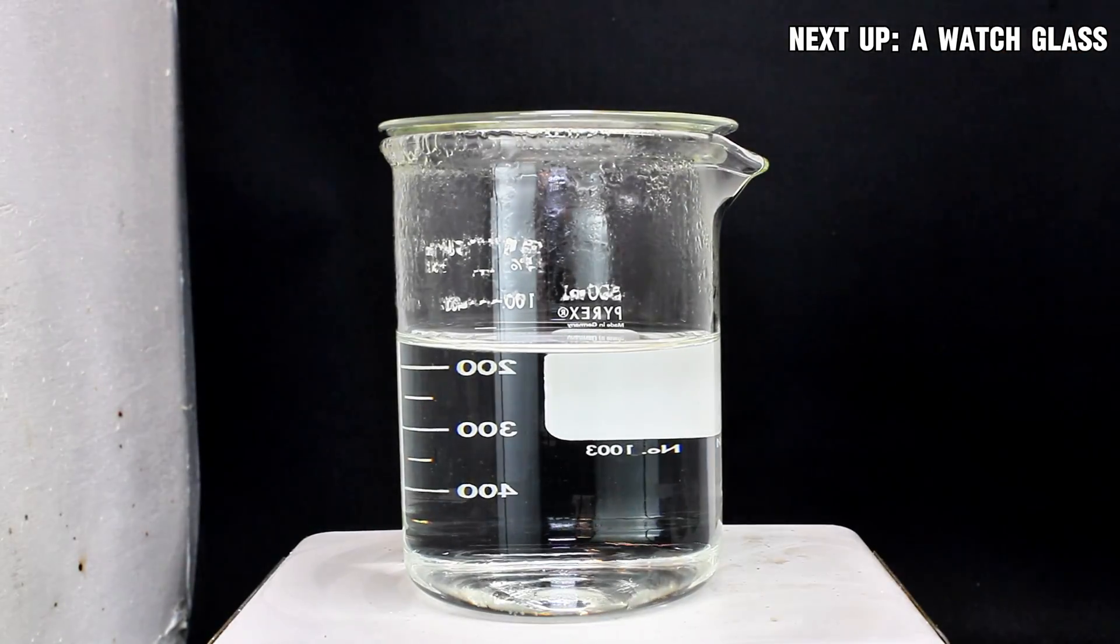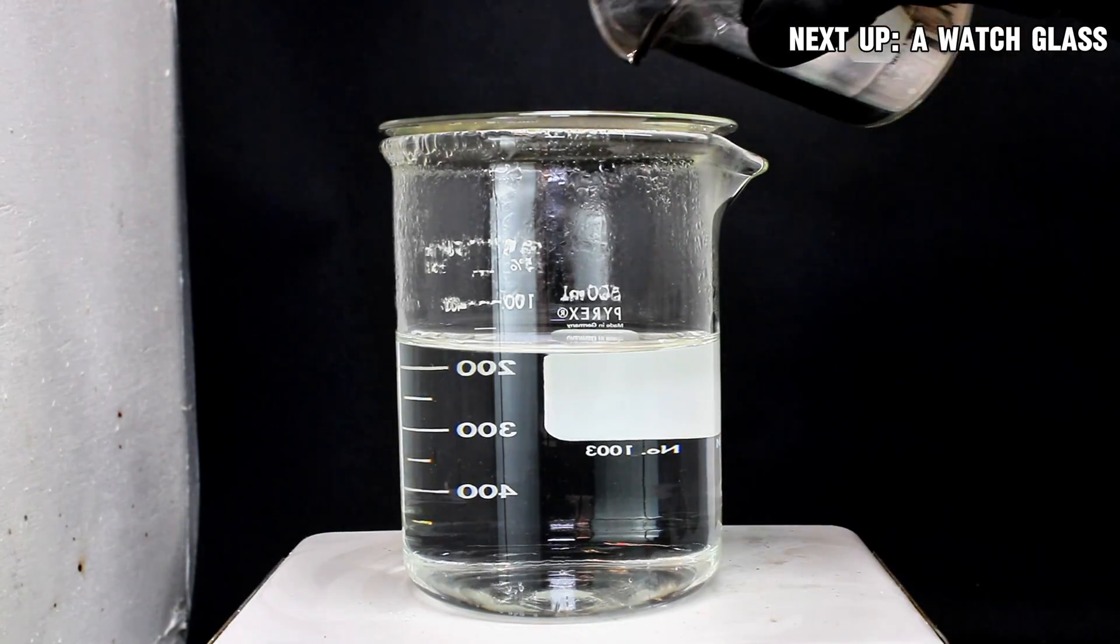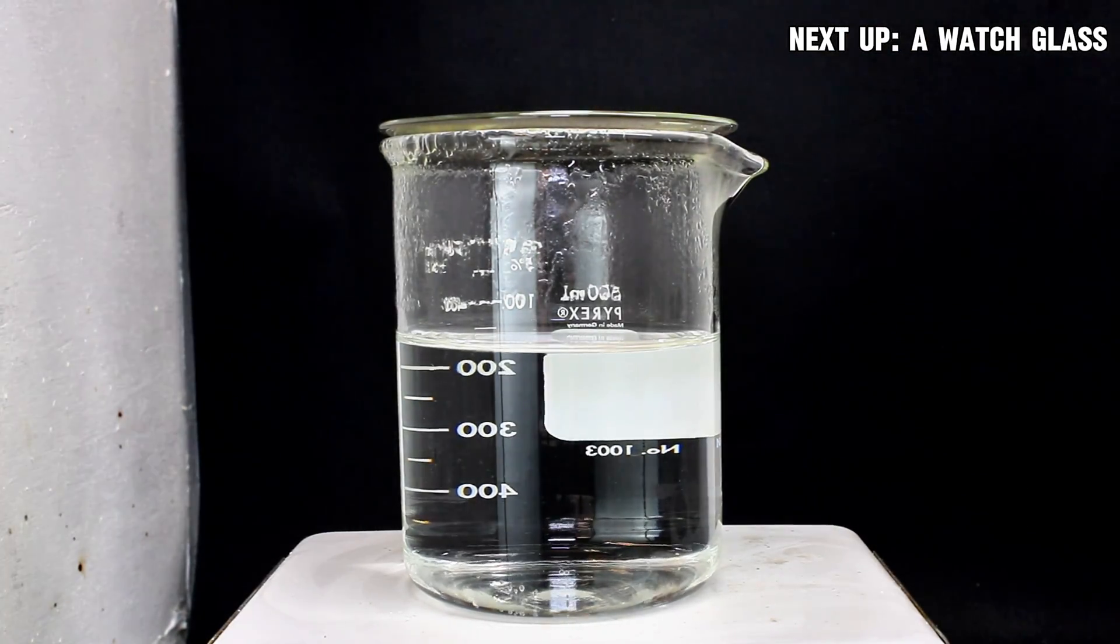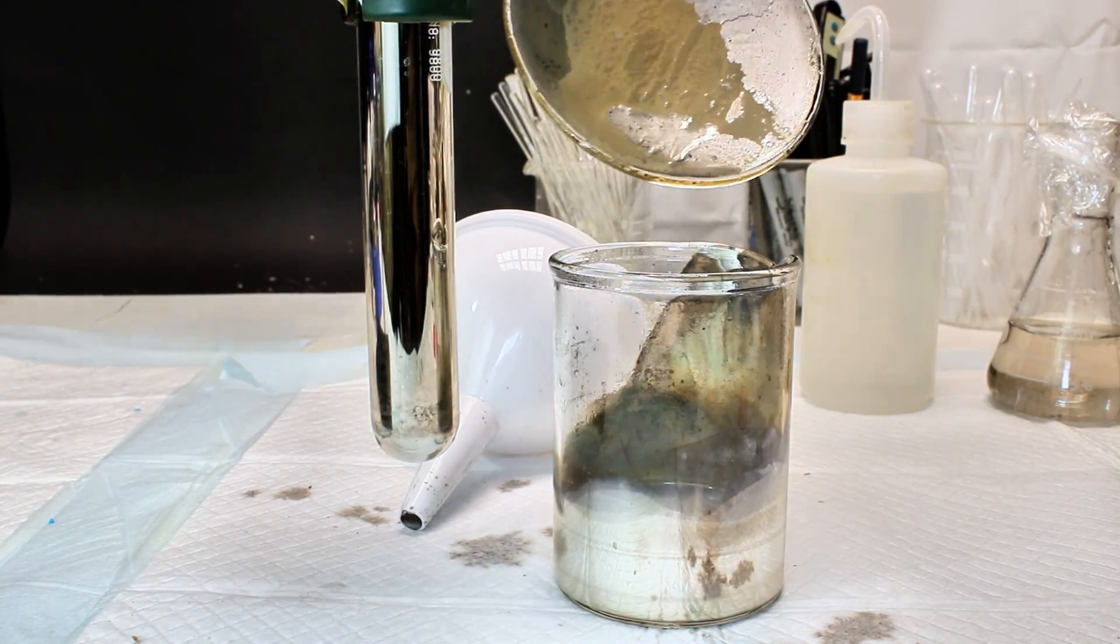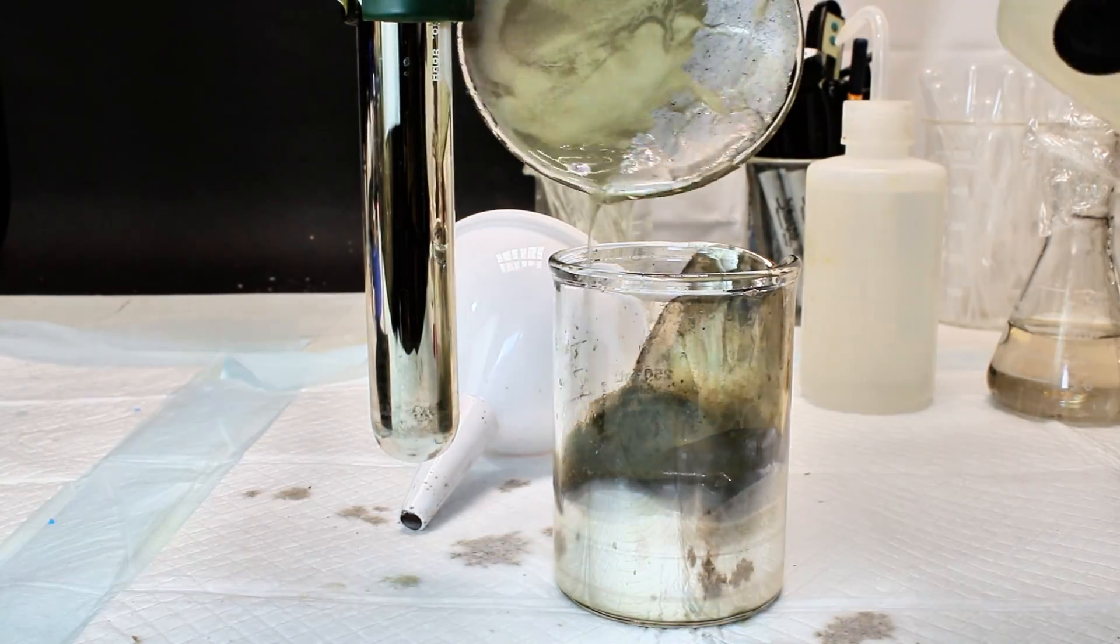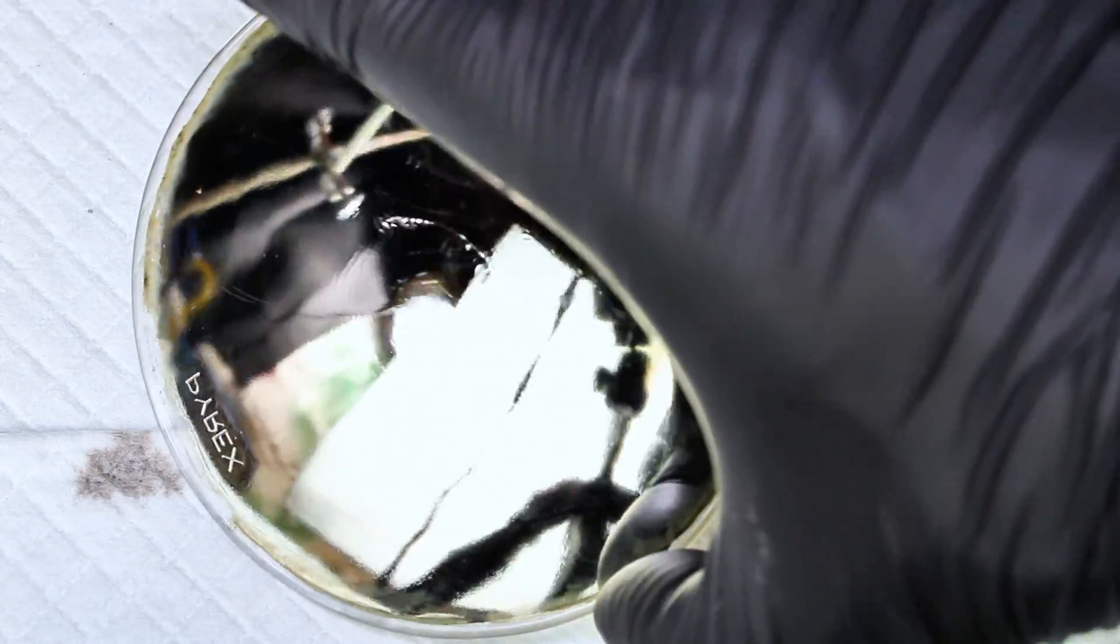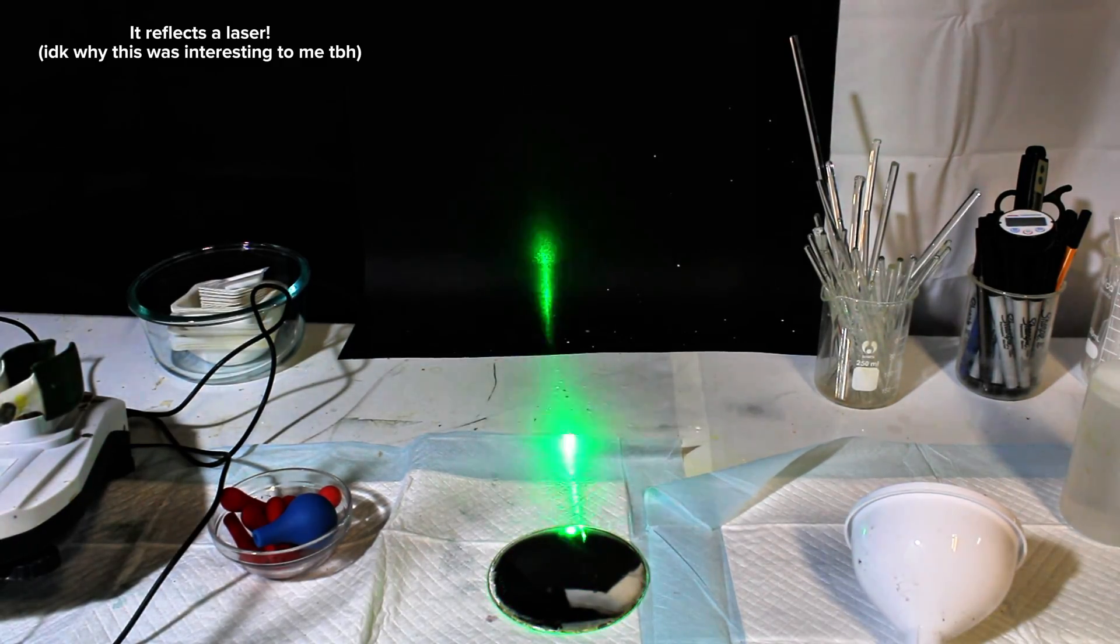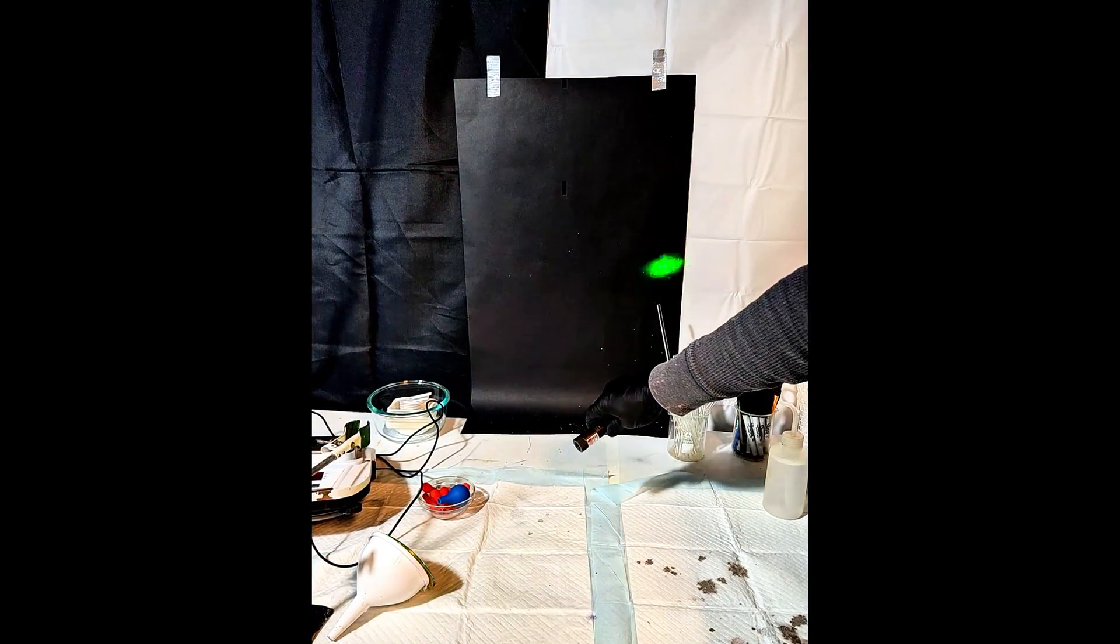Now that I had a proof of concept, I started looking around for other things that might be fun to give a mirror finish. My first idea was a watch glass, which I plated by simply adding some Tollens reagent to the glass and then placing it on top of a beaker of boiling water for a few minutes. This also gave a beautiful mirror finish, and given the fact that it's a watch glass, this one could actually make a somewhat practical mirror. I messed around with this one for a while using a green laser pointer, which as you might expect, gave a very good reflection.